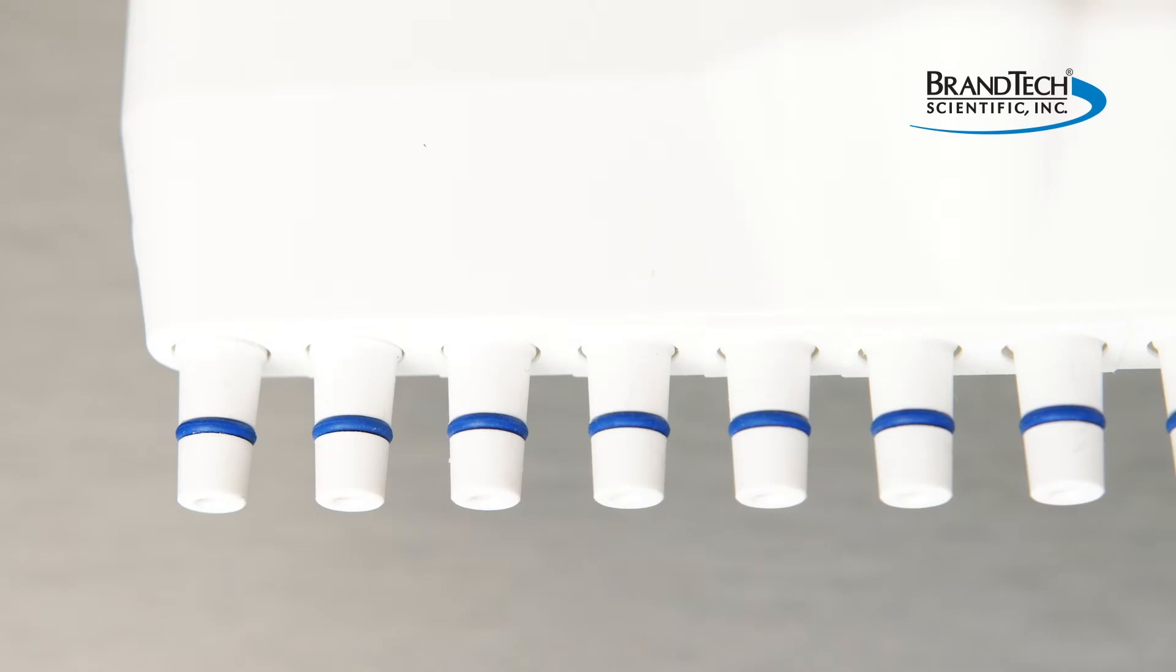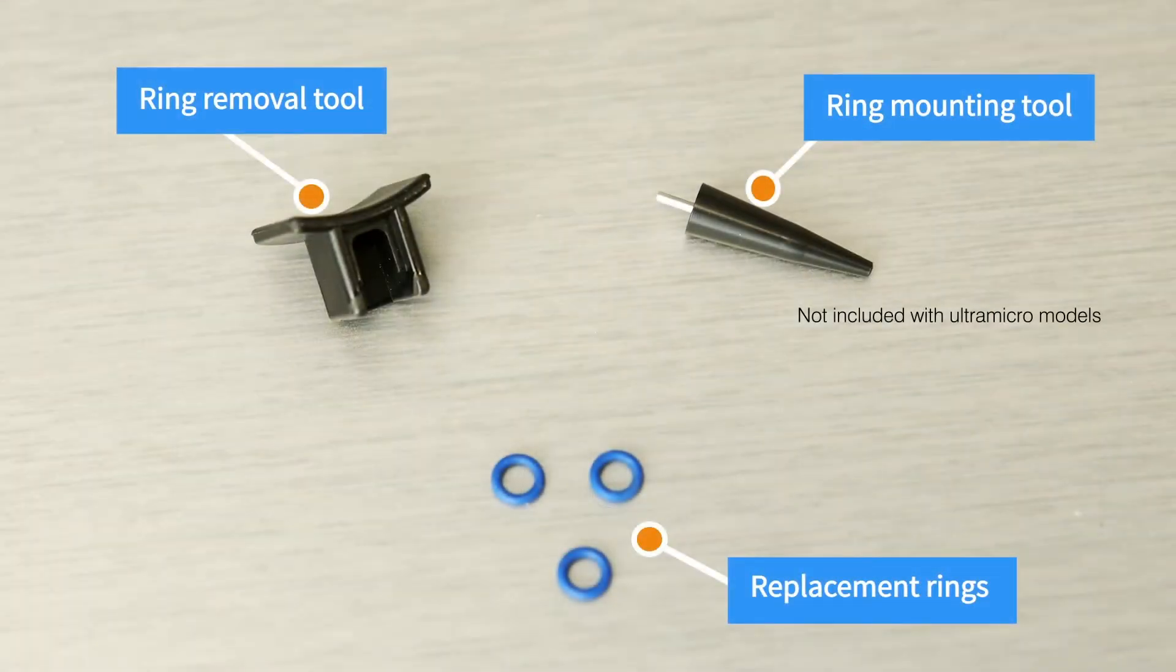If the old rings are worn but still attached, they need to be removed. Supplied in the packet of replacement rings is a small plastic ring removal tool that will assist in removing the rings.